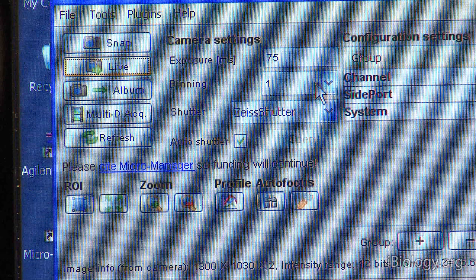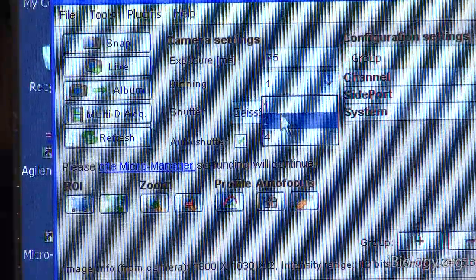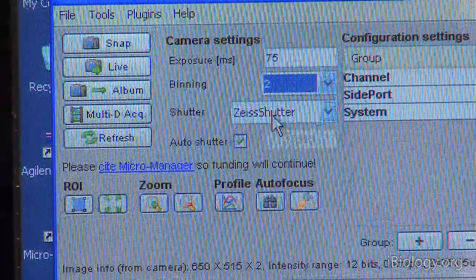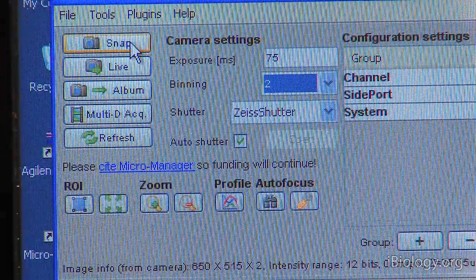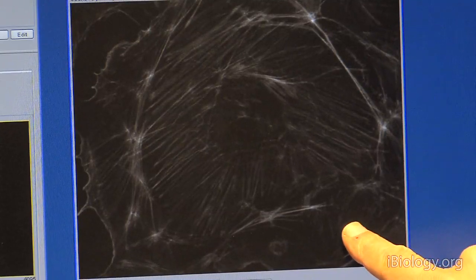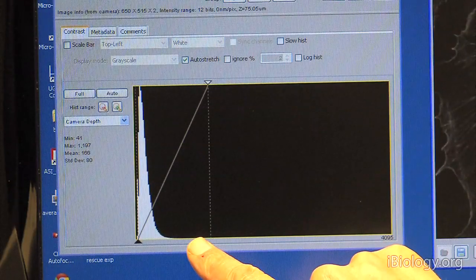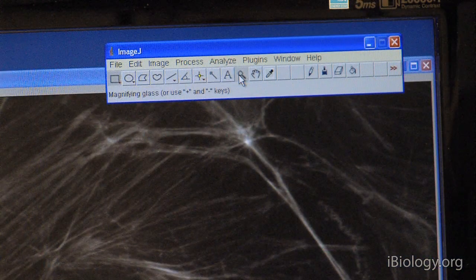Binning. We talked in the camera lecture about the ability to group groups of four pixels and read those out in one go. I can control that here. I can say, okay, give me two by two binning. So, four pixels in one. And when I now snap an image, it is significantly smaller. But you also see in the histogram that it got significantly brighter.